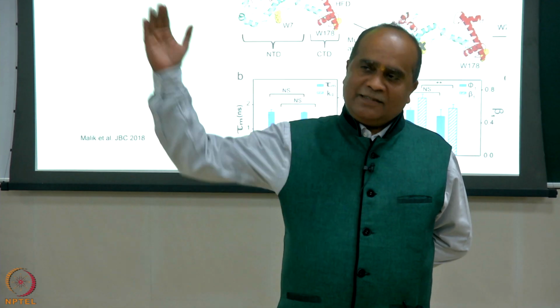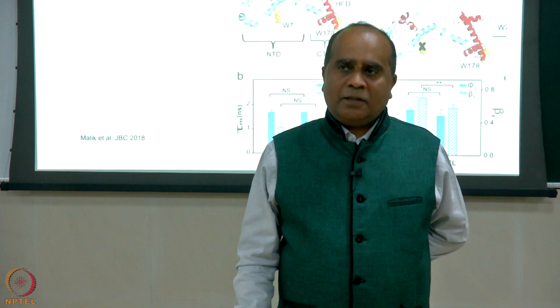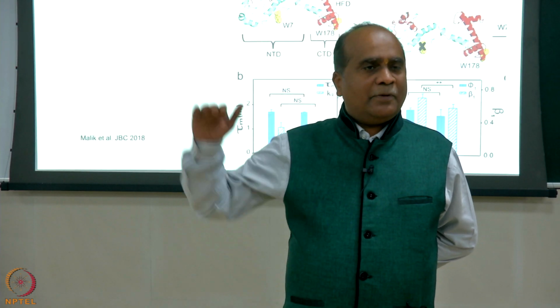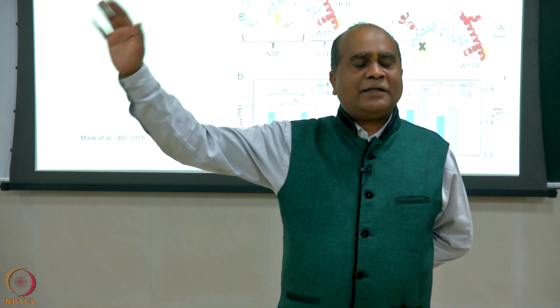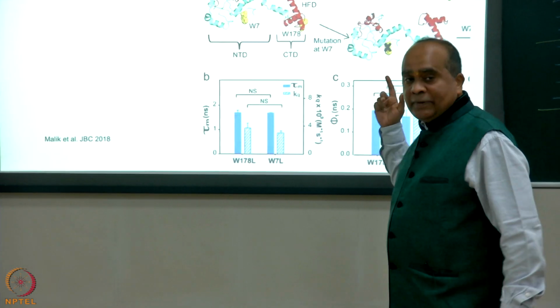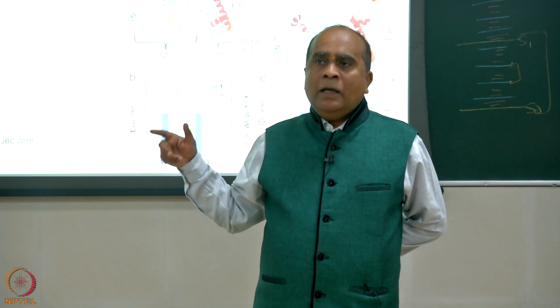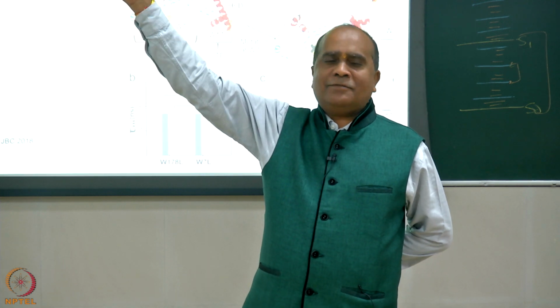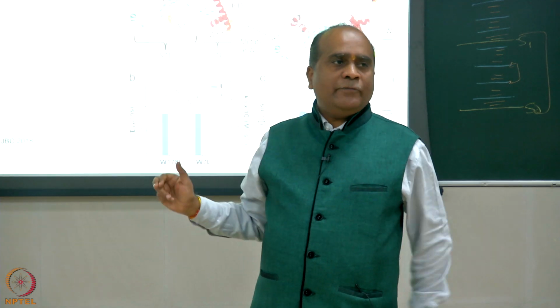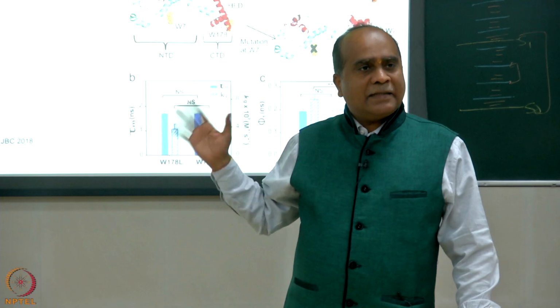You cannot wait for it to go to 500 micromolar; you can probably get some information even with 5 micromolar, using fluorescence, right. So here you will not get the atomic resolution structure you wanted, but you can learn a lot about the protein just using fluorescence. Here my 2 tryptophans were there, W7 and W178. I said 1 tryptophan is excellent, 2 is not so good, because now the signal will come from both of them. So first we let 1 tryptophan be mutated. So we make it silent.